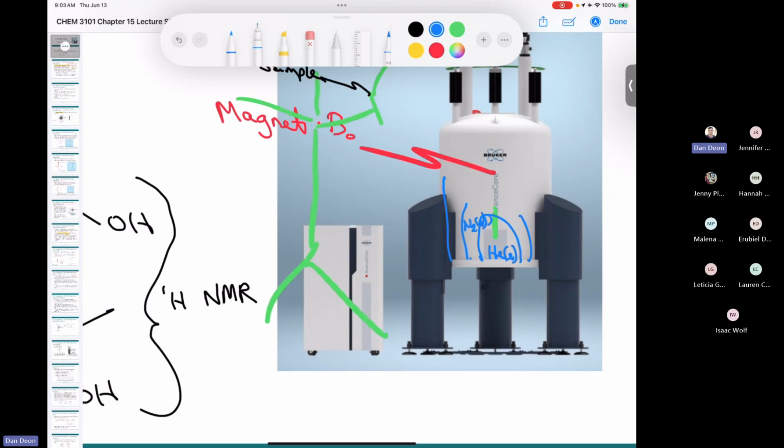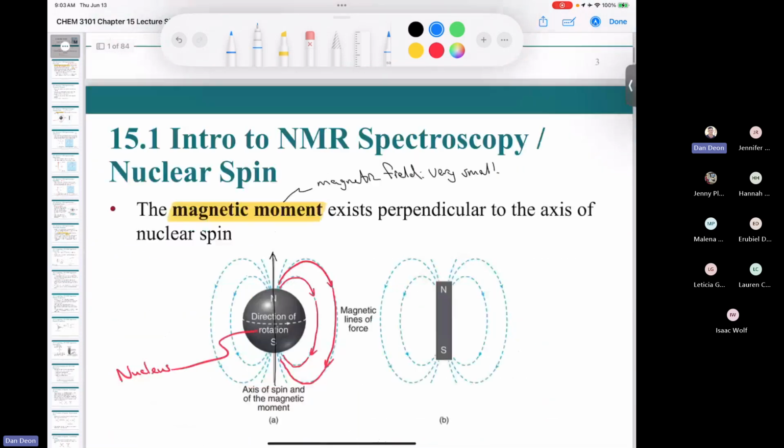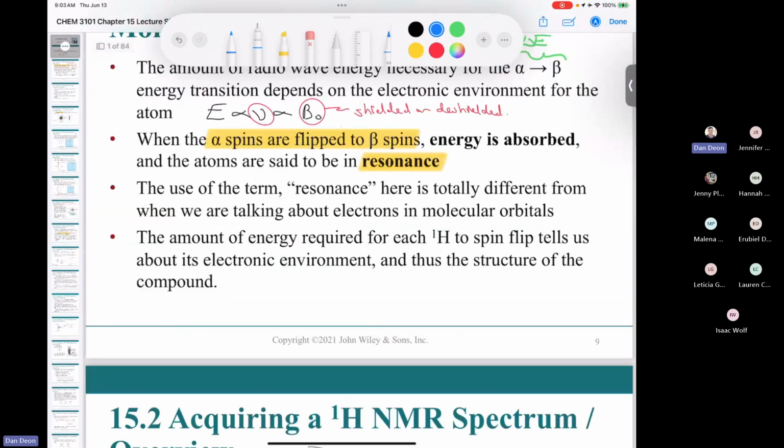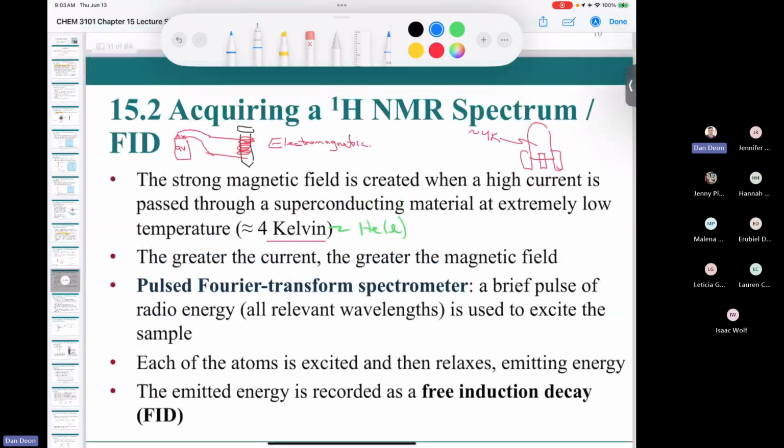Then you have a vacuum flask outside of that, like a Yeti mug or something. So inside the spectrometer, it's around 4 Kelvin. Very cold. I don't want to be inside a spectrometer. Too cold for me. All right, so there you go.